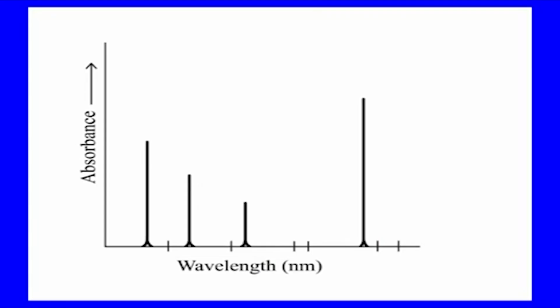Now, as I said, a flame is utilized for this atomization, but electrothermal furnaces such as a graphite furnace could also be utilized. There are 3 steps involved here. One is desolvation, that is, the liquid solvent is evaporated and the dry sample remains. Then vaporization, that is, the solid sample vaporizes to a gas, and finally volatilization, that is, the compounds that compose the sample are broken into free atoms. You will get peaks, and if you have standards, those peaks could be compared.